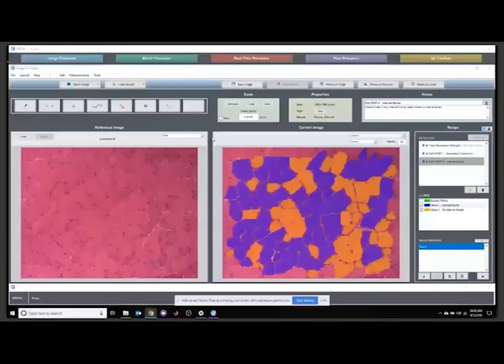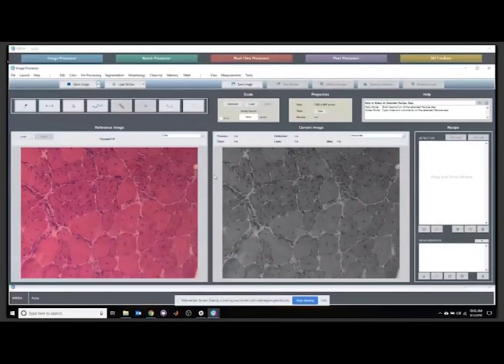So if everybody can see my screen, let me go ahead and open some of these images, and describe what the real challenge is. A lot of the variation that we see here comes from sample preparation, imaging technique, and then just the variation in the biomedical morphology of these cells. We see that there are examples of damaged fibers there. It's very hard to differentiate between the boundaries. It's very challenging to tell where these fibers begin and end, even though it's not difficult for you to do this with your eyes.